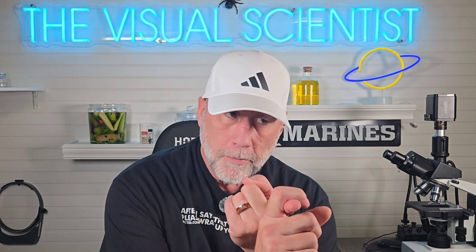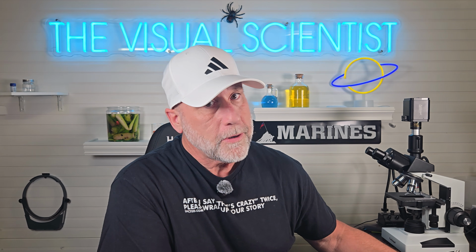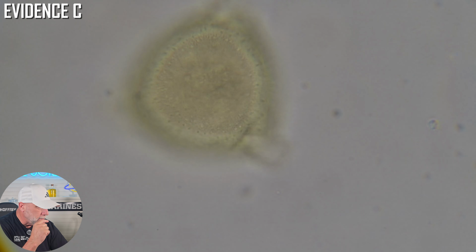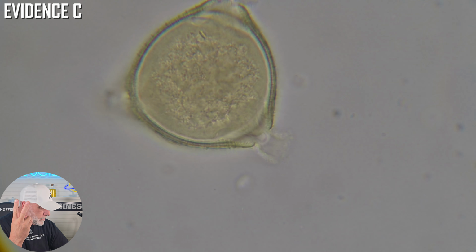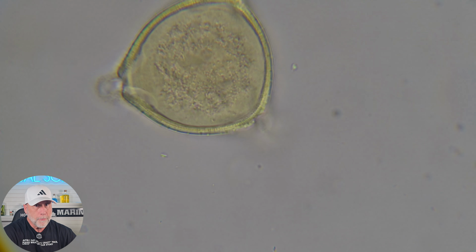Evidence A was uniform. Evidence B was almost empty. Evidence C is busy, complex. There's a lot happening at this level. So we're going to 1,000 times. The kill shot. Yeah, this one's a dramatically different sample from the first 2. I know what I'm looking at, and I'm going to tell you exactly what it means at the whiteboard.